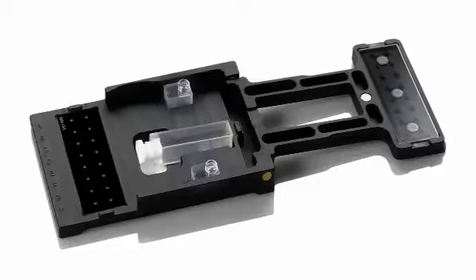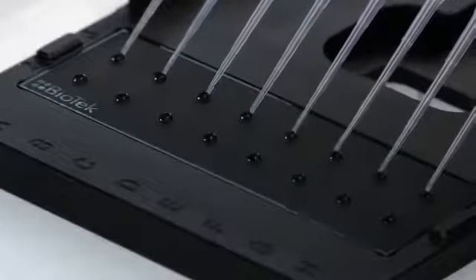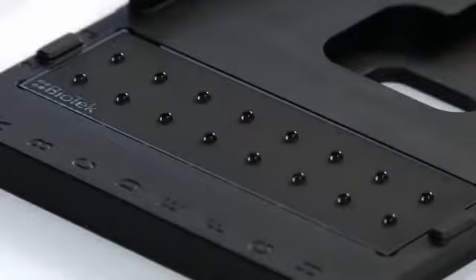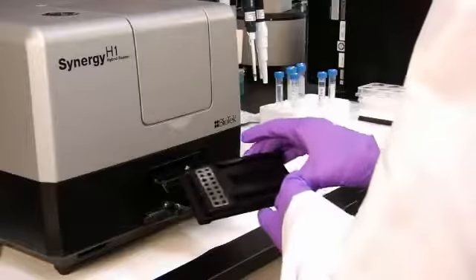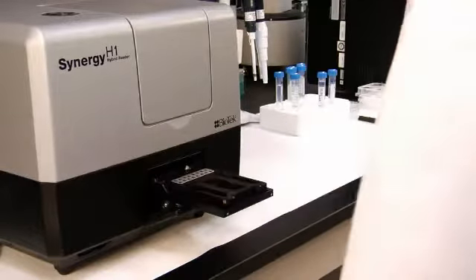In addition, Synergy H1 is compatible with Biotech's unique Take-3 plate. The Take-3 plate has a simple but innovative design for measuring multiple 2 microliter samples, which is particularly useful for direct nucleic acid and protein quantification.